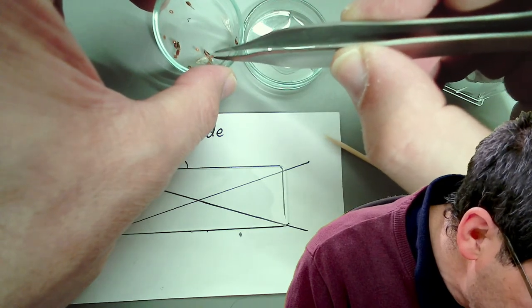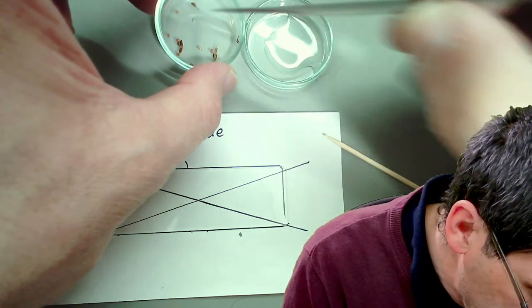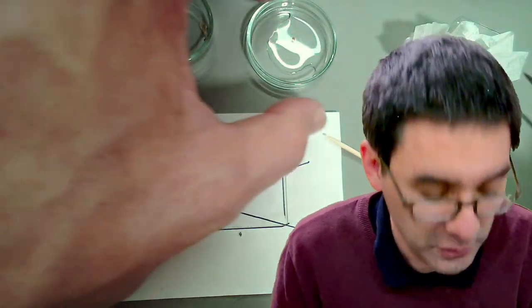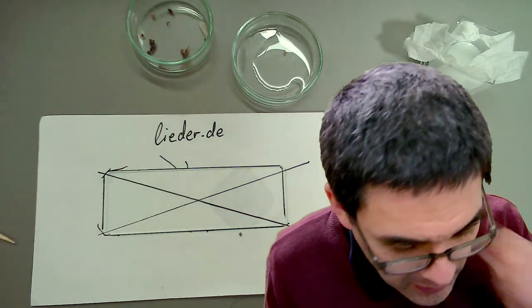And those mites seem to be hydrophobic anyway. So, oh yeah, see, it's difficult to get. Okay, and I'm going to put it into soap water. You might not be able to see it. And the other one I'm just going to mount directly.